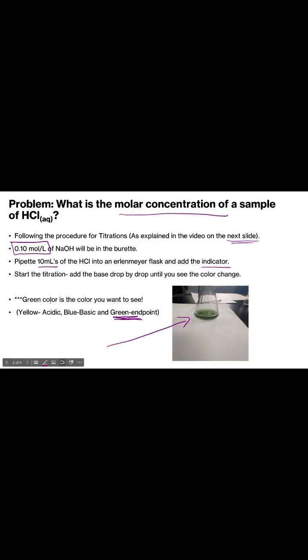I just took a picture of one of the students' results today. They used quite a bit of indicator, that's why it's pretty dark, but it's still that green color. It's not yellow and it's not blue. So that's a great color to see.